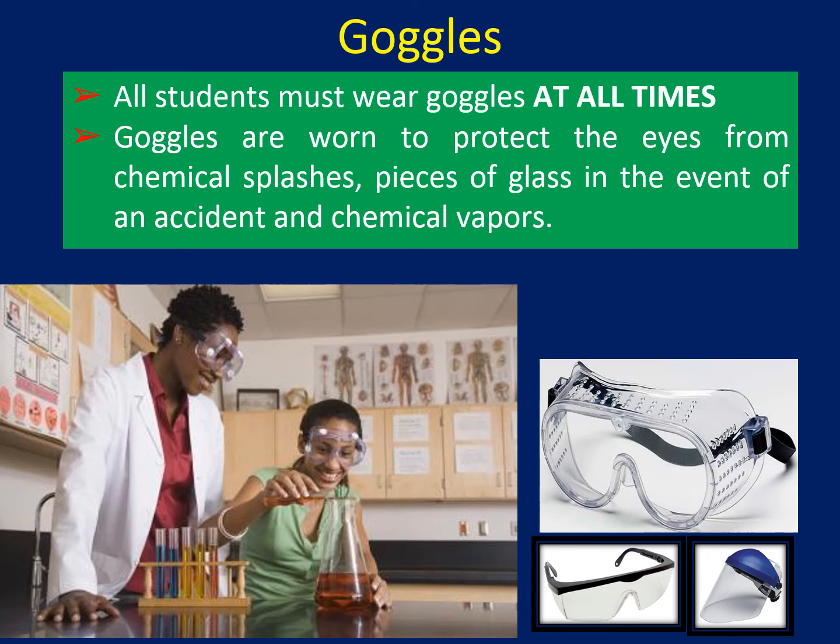One time I remember, when I was an undergraduate, I was handling chemicals, and the lid was not tightened enough, and it fell down onto the ground, and the chemical was splashed into my eye. It was mercurous chloride, very toxic, and fortunately it didn't burn my eyelid, it just touched my eye, and I washed my eye with plenty of water. I don't want that to happen to you. That's why I always recommend you to wear goggles even if you are not doing any experiments.